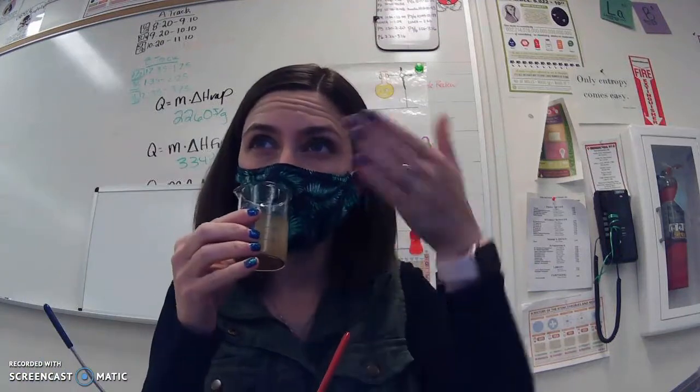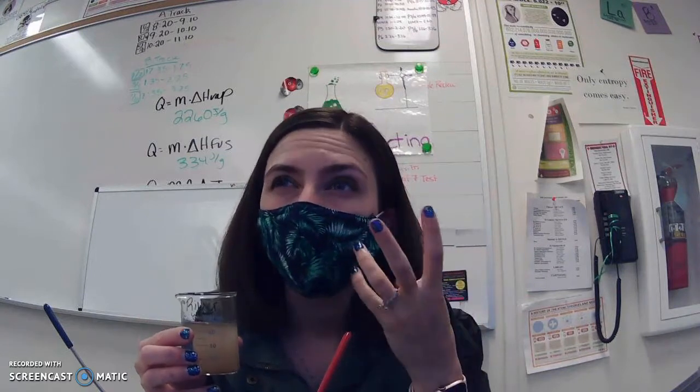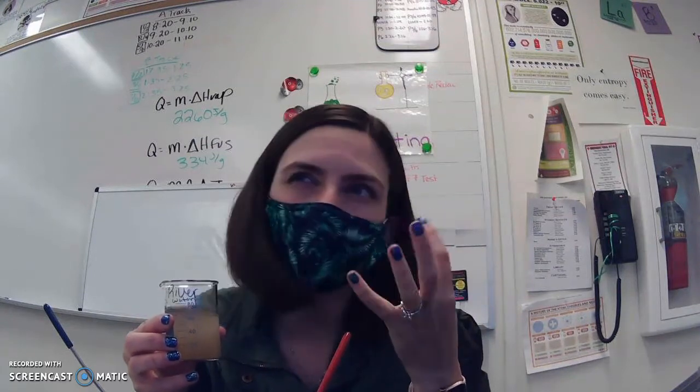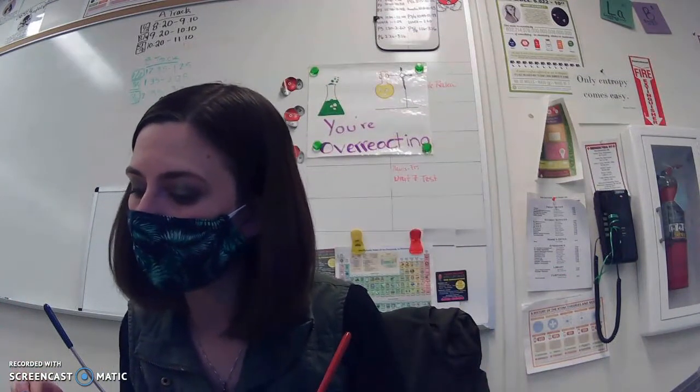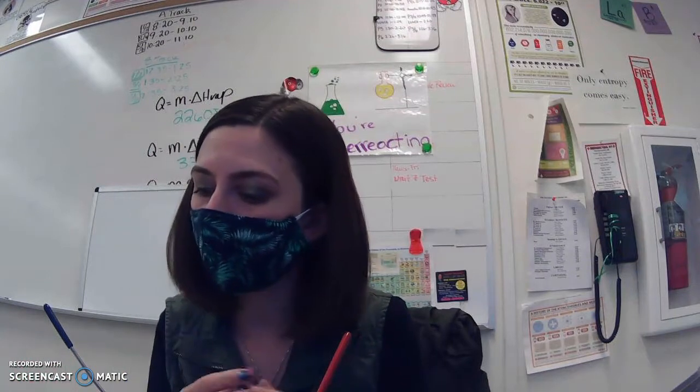If we were to smell it, so we waft and smell, think about what the lake smells like. If you're at Lake Kauai, or in general, rivers smell a little different. They might have a little musty smell, a little woody, or it might just smell like dirt, but it has a different smell than just pure water. So describe the color. Is the water sample turbid? So are there things floating, or is it clear when you're describing the color?